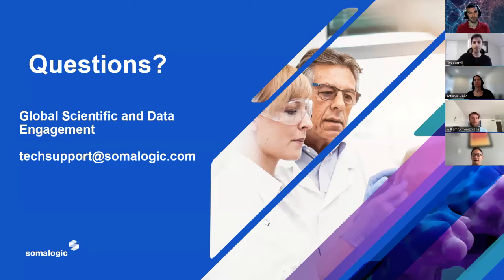Okay. And the next question is, biologists, when they do discovery proteomics, they like to validate their results. And because your data is discovered with aptamers, how reproducible are your findings? Can they be validated by antibody or imaging techniques that biologists are familiar with?